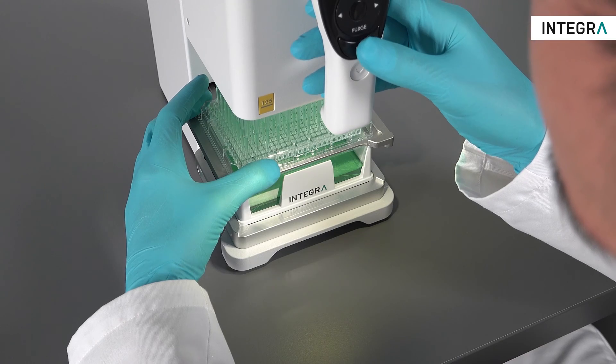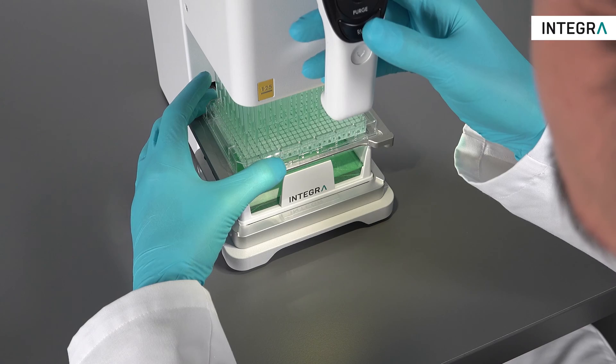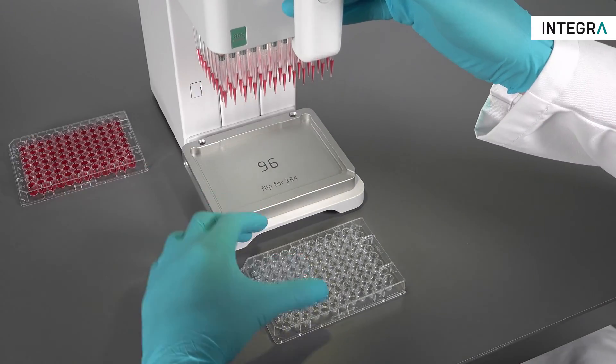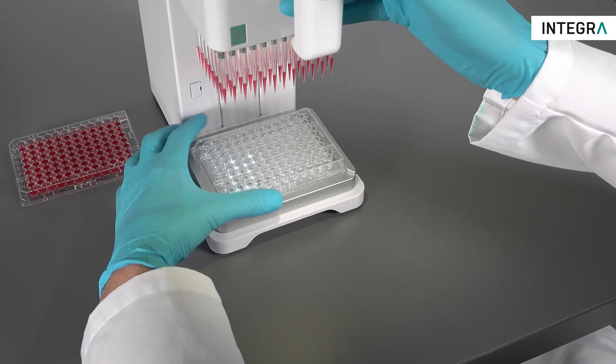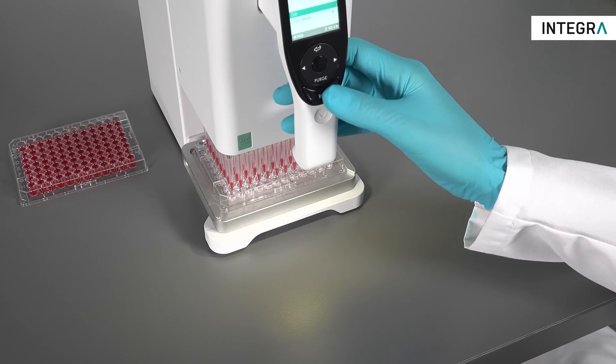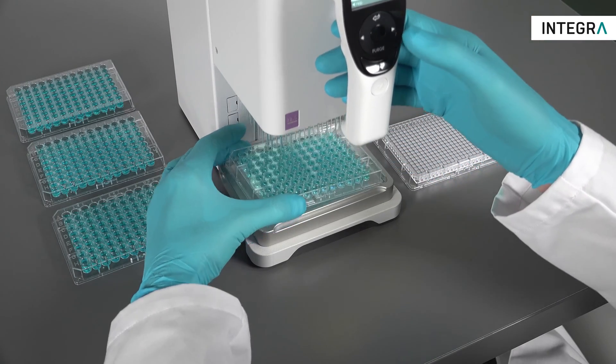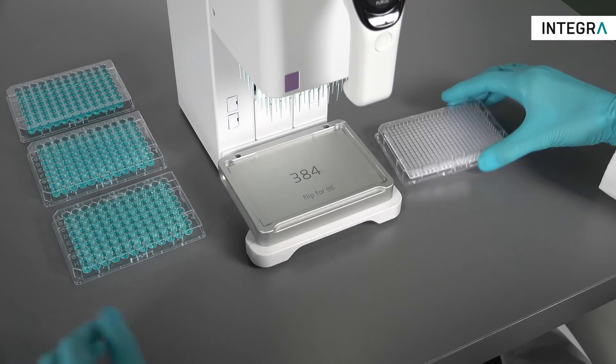A second stage can be used if so desired. Plate to plate transfers, such as 96 to 96, are also easily accomplished with the MINI 96, as well as reformatting between 96 and 384 well plates.